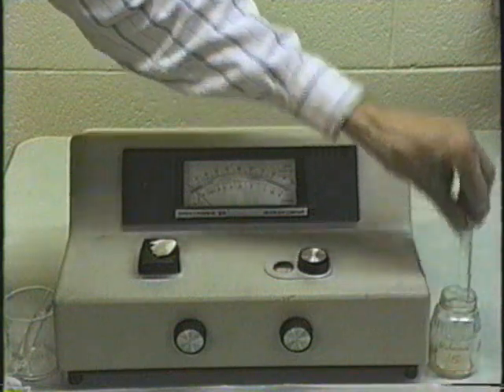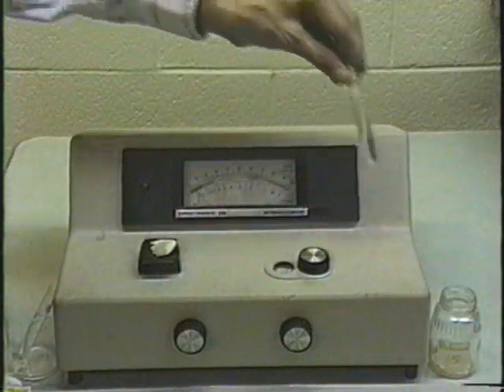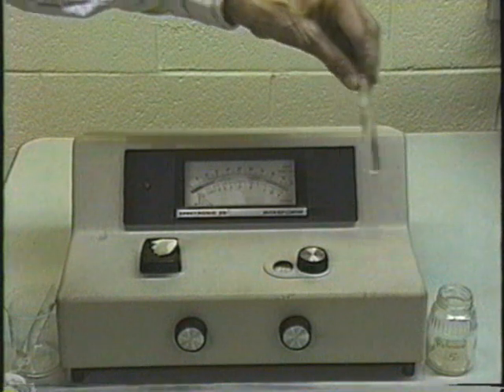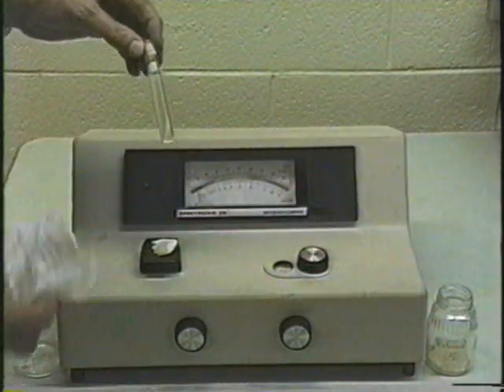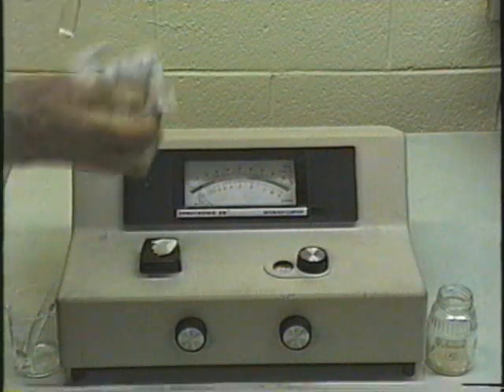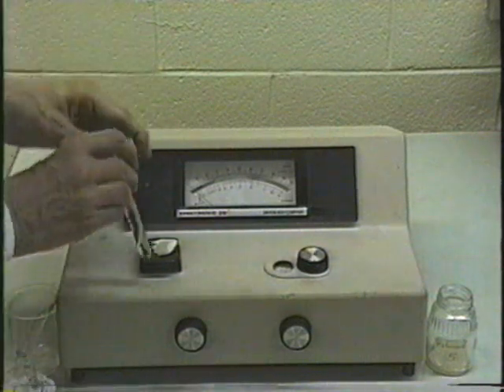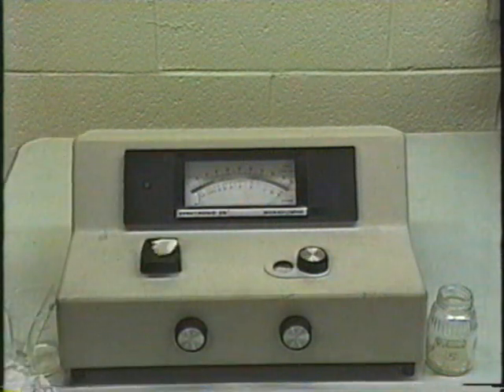Now you'll take the reference cuvette. This is called the reference cuvette. It stays with the spectrometer. Do not move that reference cuvette around. This reference cuvette has nothing but distilled water in it, and you wipe this off again with your towel, and you put it in the sample compartment.